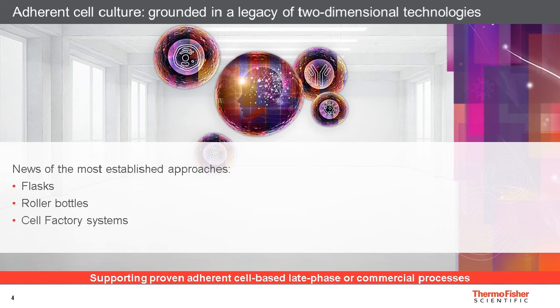And I will close with a short overview about novel downstream options which solve unique challenges in the area of adherent cell-based biomanufacturing. So in those first few minutes, let's have a quick review about a little bit more mature technology approaches, but some news about them.